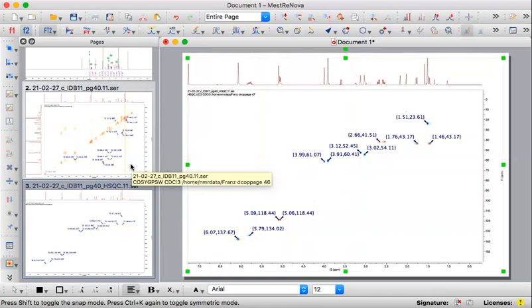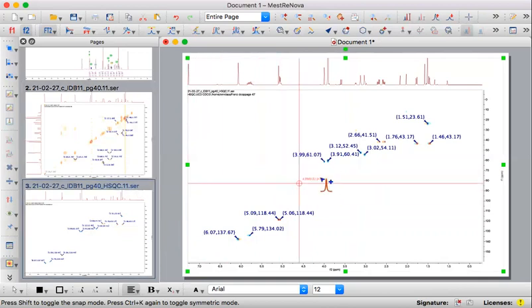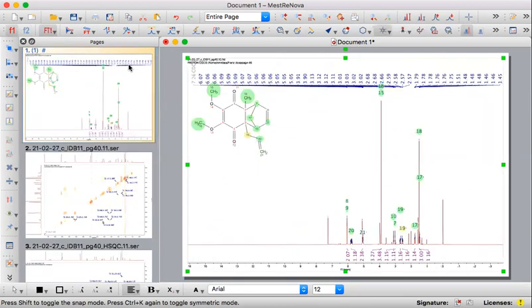There is one other thing that I want to show you, and this is an extra step. When you are doing research, if you ever have to do structural elucidation, you have a spectra of a compound that you don't know what it is, here's a little trick that will definitely help you with that structural elucidation process. So once we have everything set, let's go back to this hydrogen spectra.